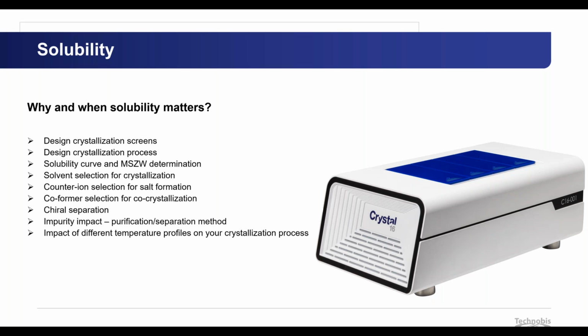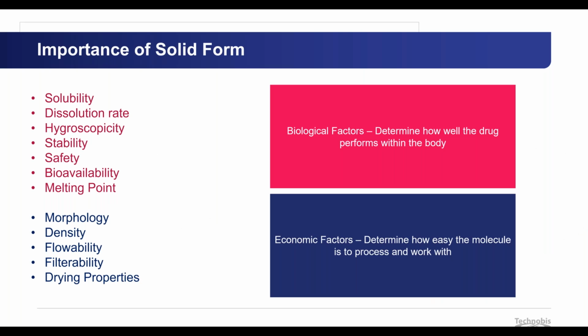Crystallization also is a purification method at the end of the day. So it's quite important why we should look into crystallization and into solubility, and actually it's the way that we start.